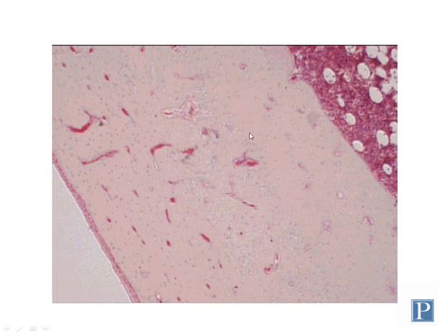For now, you should focus on this part of the bone, which is the compact bone. And you can see that it is surrounded by a layer of connective tissue, which is called the periosteum. The periosteum is composed of a dense, irregular connective tissue and also contains some osteoprogenitor cells that give rise to osteoblasts and osteocytes. This region, the periosteum, is analogous to the perichondrium, which surrounds cartilage tissue.